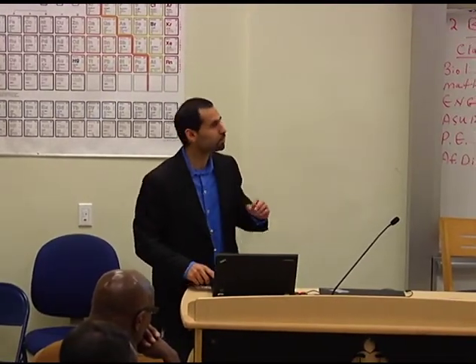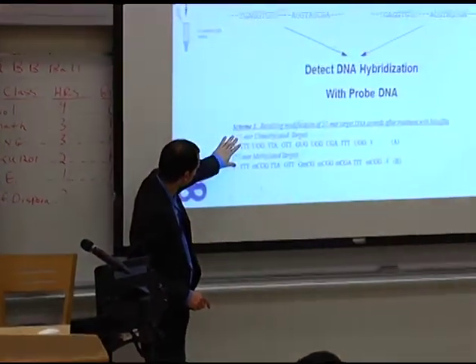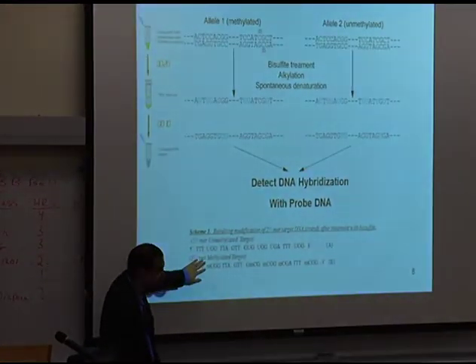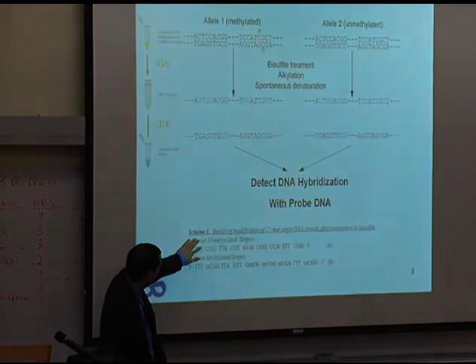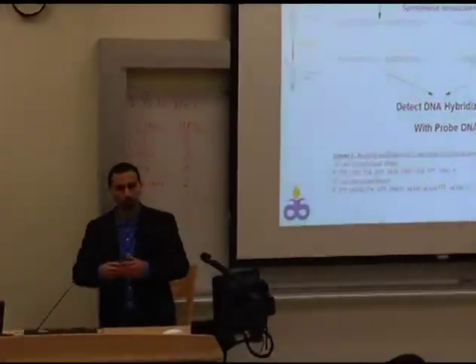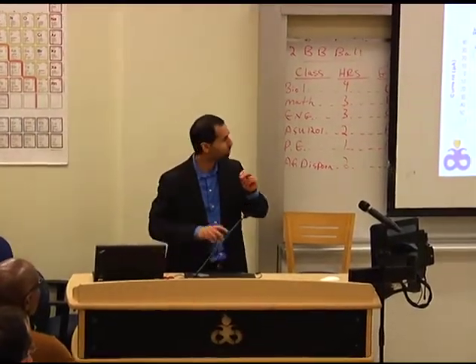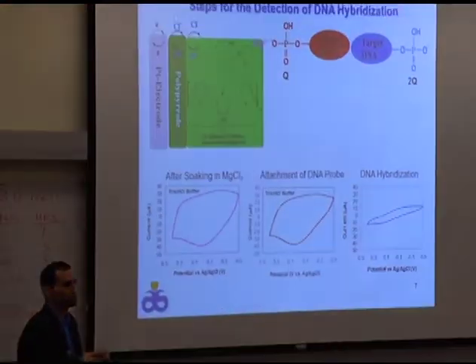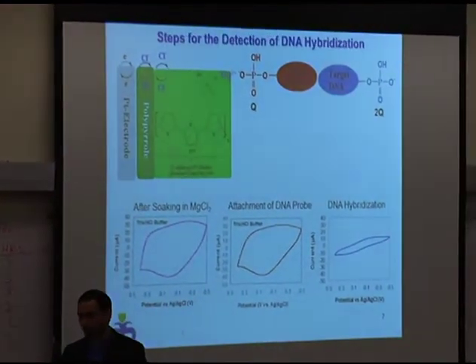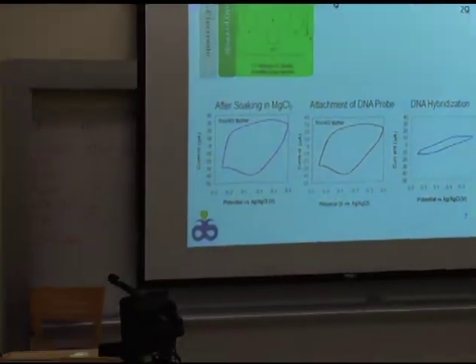If we don't do this treatment, regardless of whether it's methylated or unmethylated, so for example, here are the target sequences, unmethylated and methylated, you would expect the methylated in a prostate cancer patient and the unmethylated in a healthy individual. They would both bind to our probe, and they would both show a decrease in the CV, as we saw here, if we don't perform the bisulfite conversion, if we don't use that extra step. So that's really key here, to use that bisulfite kit to do the conversion.